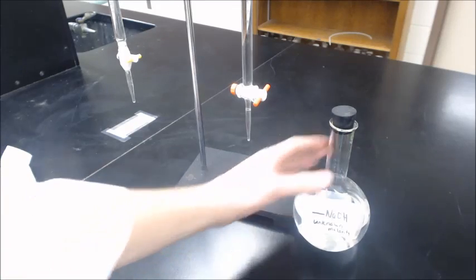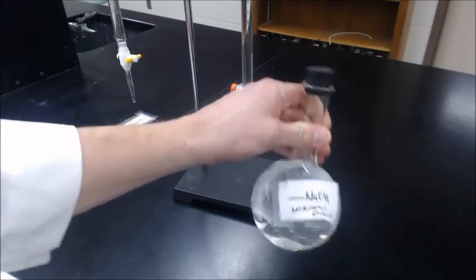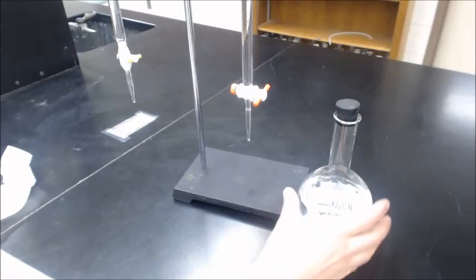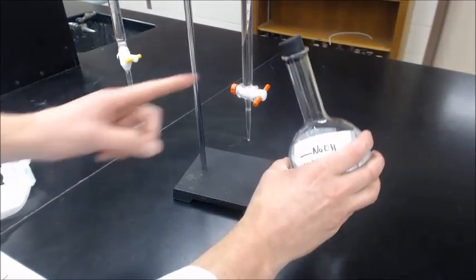This is a Florence flask, and you're going to make your own solution following the directions in the lab book. This will be used to fill up this burette here.